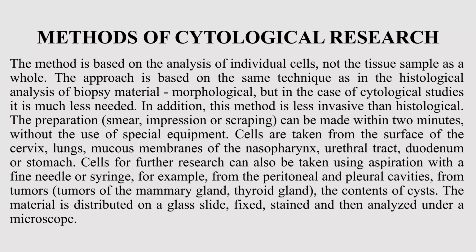in strict environments, with strict resources. Usually, these cytology slides are easy to prepare. You take some impressions, scrapings or smears on glass, and on this surface we make some preparation like drying and staining.